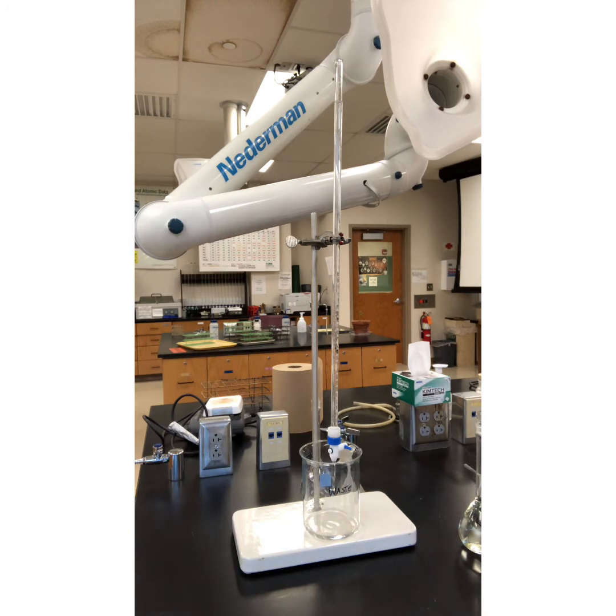We're going to pipette 25 milliliters of the approximately 0.025 molar potassium ferrocyanide into a 250 milliliter Erlenmeyer flask, and add about 5 milliliters of 3 molar sulfuric acid and 3 drops of freshly prepared potassium ferricyanide solution and our diphenylamine indicator.